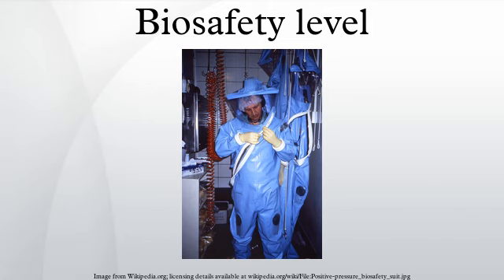When dealing with biological hazards at this level, the use of a positive pressure personal suit, with a segregated air supply, is mandatory. The entrance and exit of a Level 4 biolab will contain multiple showers, a vacuum room, an ultraviolet light room, and other safety precautions designed to destroy all traces of the biohazard. Multiple airlocks are employed and are electronically secured to prevent both doors from opening at the same time. All air and water service going to and coming from a Biosafety Level 4 lab will undergo similar decontamination procedures to eliminate the possibility of an accidental release.